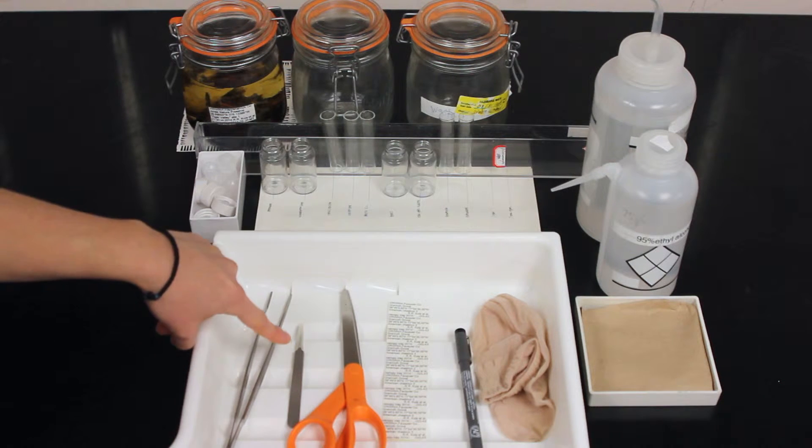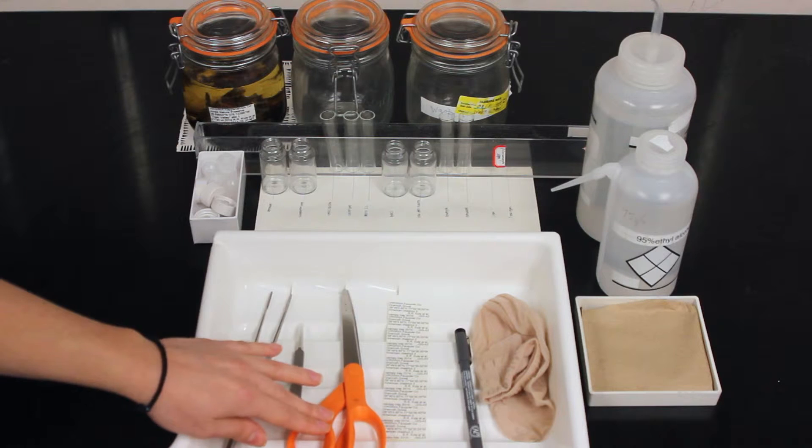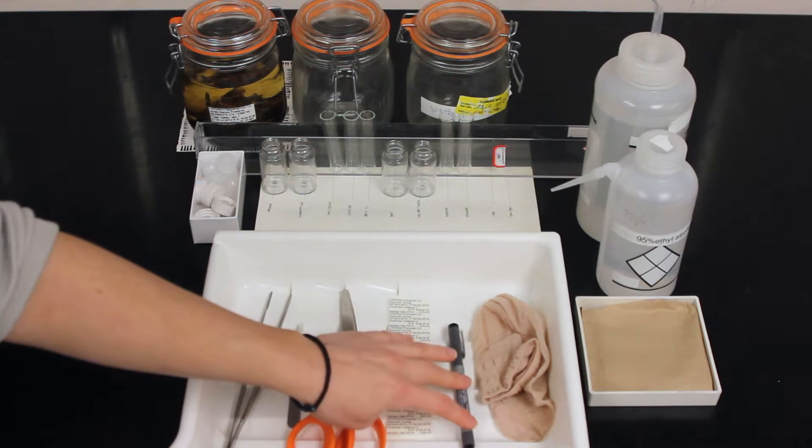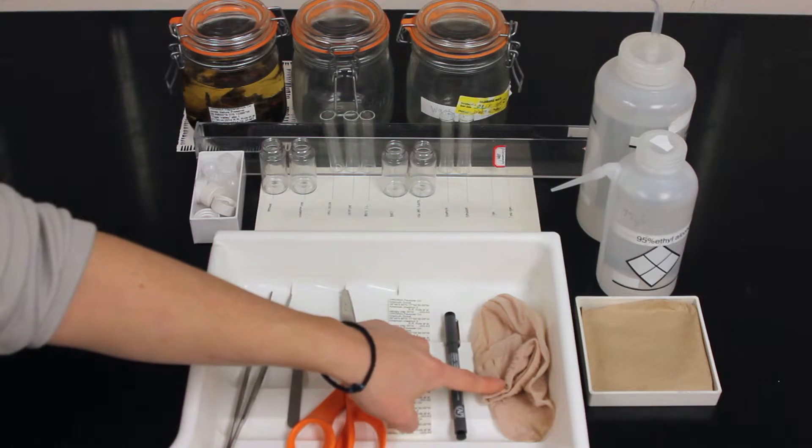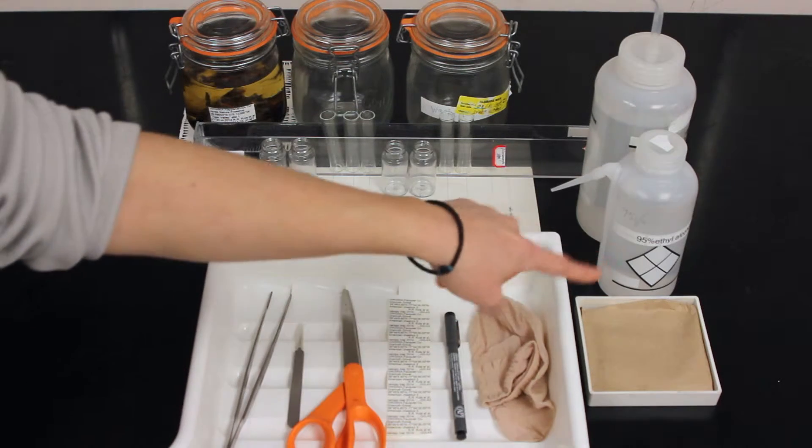A large sorting tray, large and small forceps, scissors, sample labels, black pigment pen, pantyhose, and a trash tray.